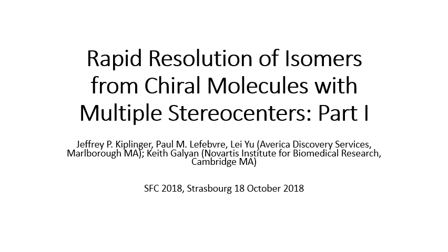As chromatographers, we don't get too excited anymore about a presentation at a conference on resolving two enantiomers from a racemic mixture. SFC has been associated with chiral resolution for quite some time, and these kinds of presentations are routine. What I want to talk about today is less routine.